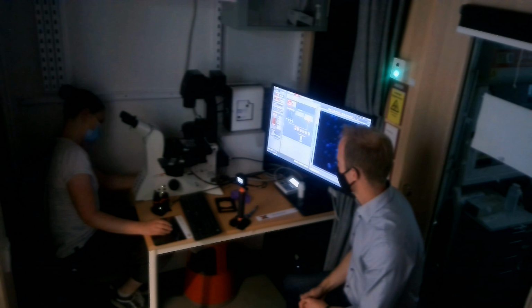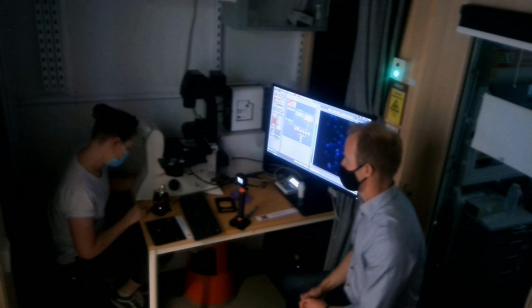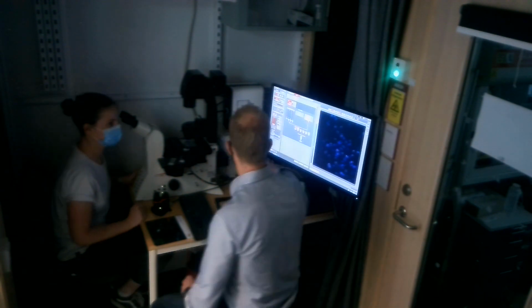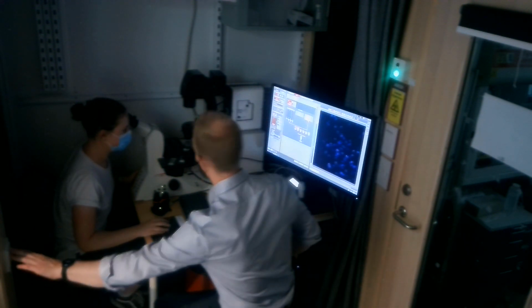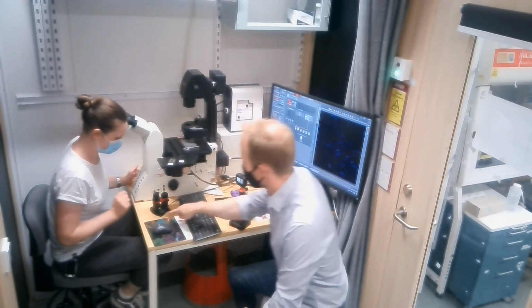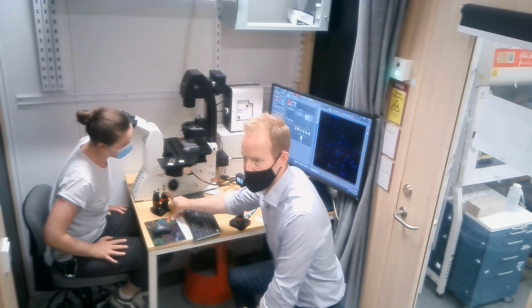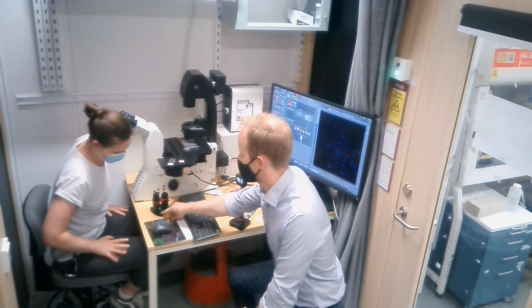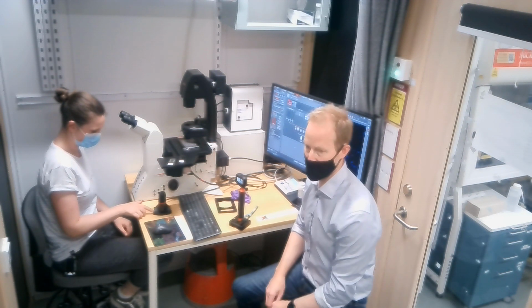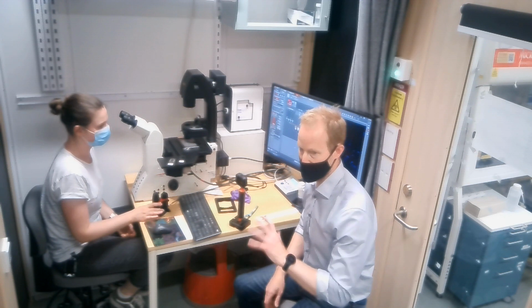You can start imaging if you want. Okay. What else? Yeah, we can change here to coarse as well, right? Yes. So if we, for example, want to change the wells, you can stop that one if you want to put light on there or something. So on these ones, it's written here. Z is the focus. This is a focus also right there. So you have Z coarse, Z fine, and the same thing with X and Y. You have X and Y fast and precise. So when you click on them, you can get it to be more precise or fast.